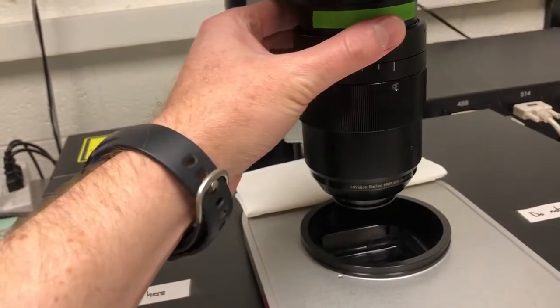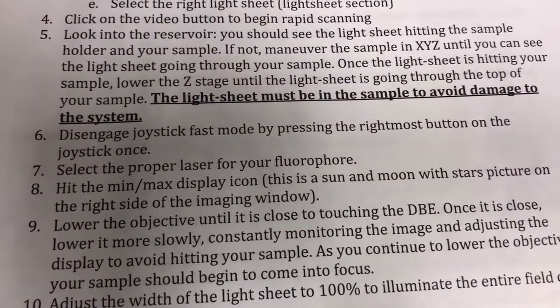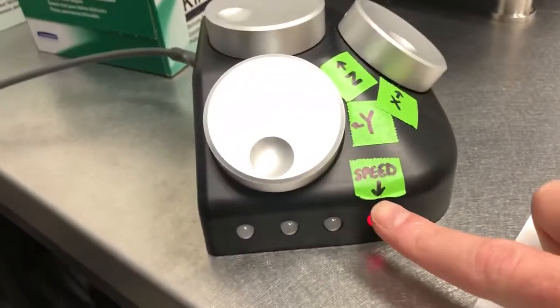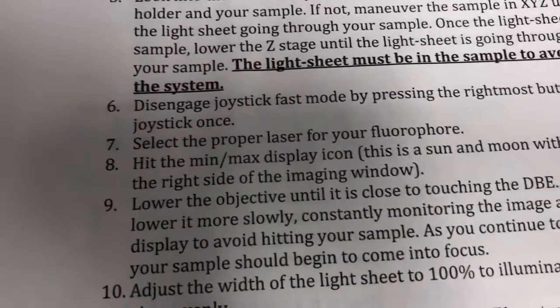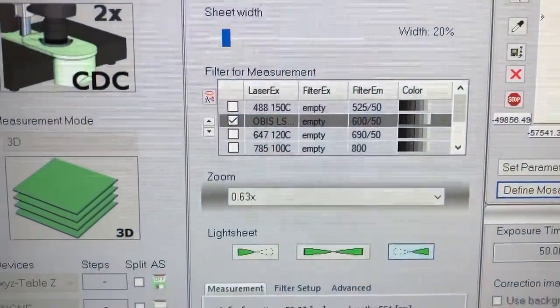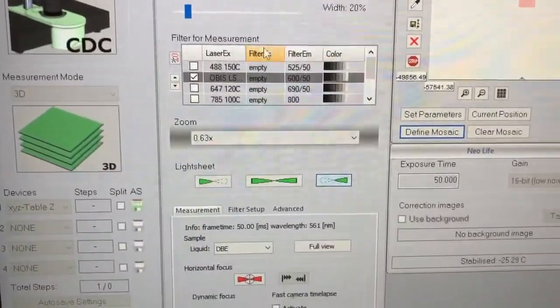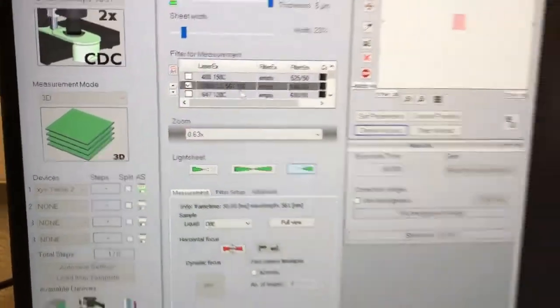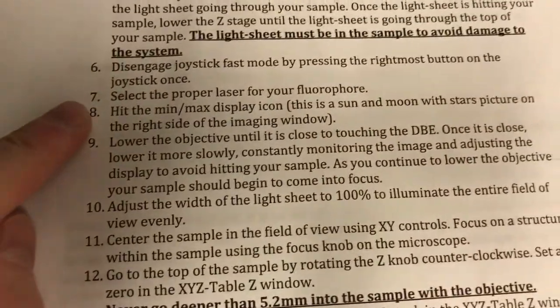Step six: disengage joystick fast mode by pressing the rightmost button once. Step seven: select the proper laser for your fluorophore. This sample has Alexa Fluor 568 fluorophores, which can be excited by the 561 laser we are currently using. Step eight: hit the minimum and maximum display icon — the sun and moon with stars picture on the right side of the imaging window. Clicking this performs an auto-contrast; it doesn't change the data, it just changes the display so we can see something.